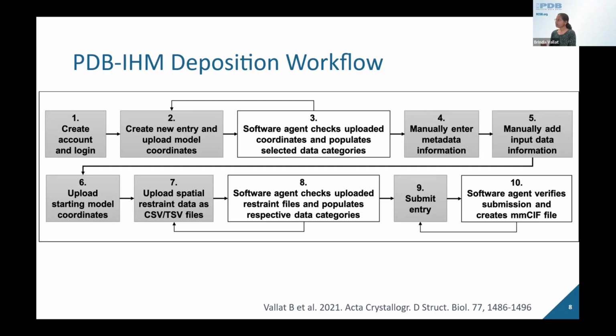This is the deposition workflow. Once that's done, one of us, Monica or me, will go and check as a curator. We'll have access. We'll be able to check, make sure everything is there, whatever is needed for deposition. Make sure it's compliant, nothing's missing. And then we'll say, okay, it's all complete. At that point, accession code will be issued and validation reports will be created. You'll be able to see the validation report.